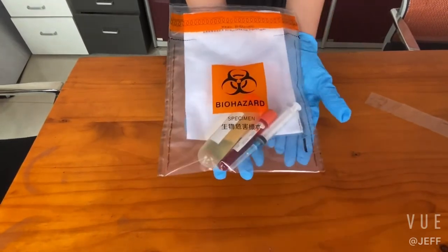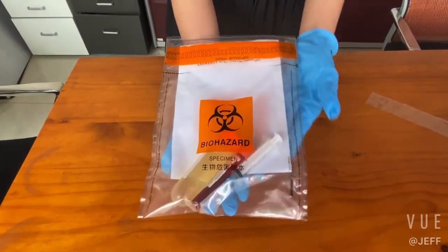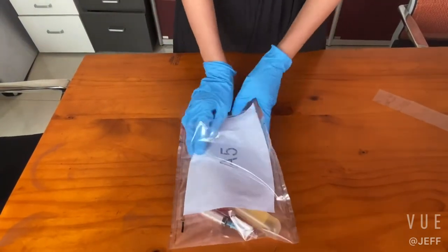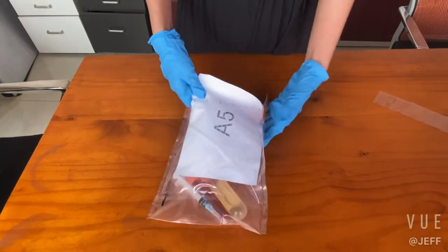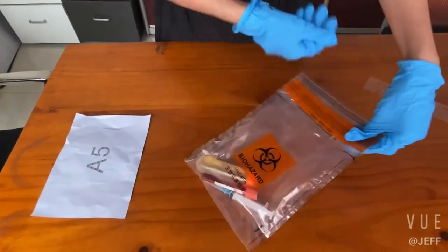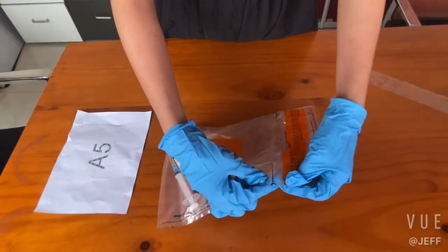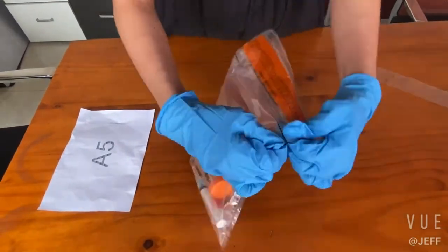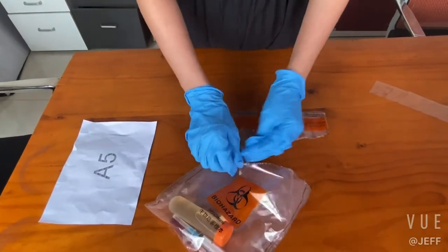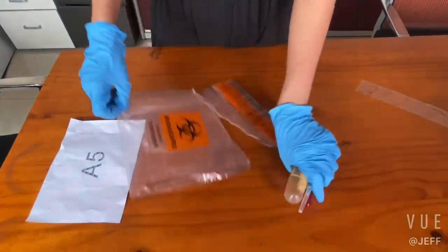We can see this. And if you want to open the bag, take out the document first, then tear from here, and take out the materials.